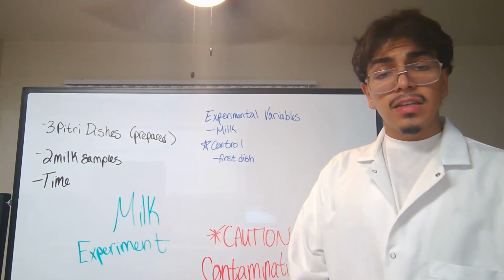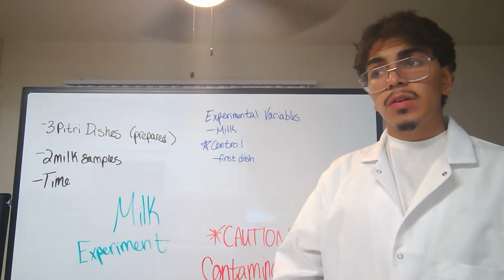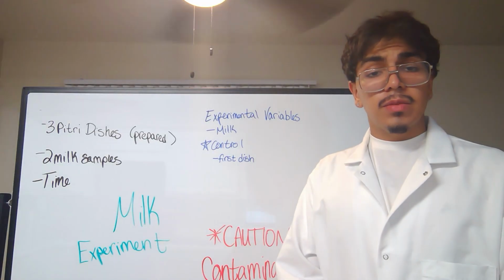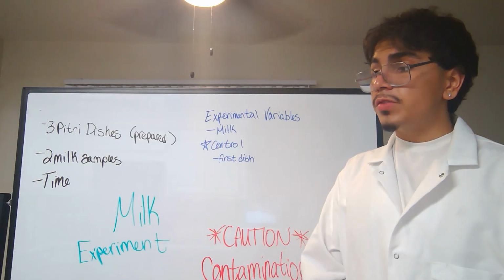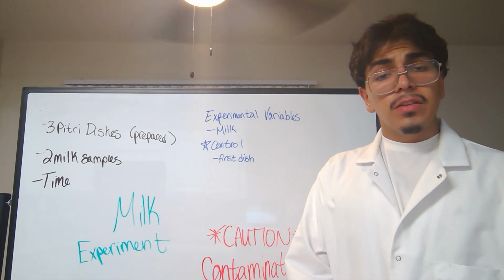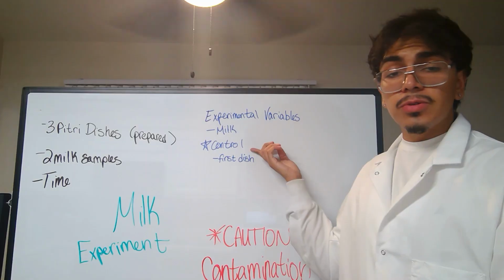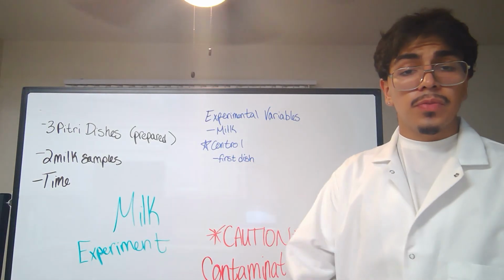I would like to see how much bacteria is in milk after it has been outside for a certain amount of time. We will be using regular milk to show the amount of bacteria that is in the milk in the fridge when it's safe to consume. Additionally, we have our control variable, which will be our first petri dish.